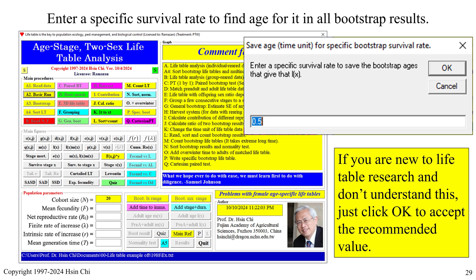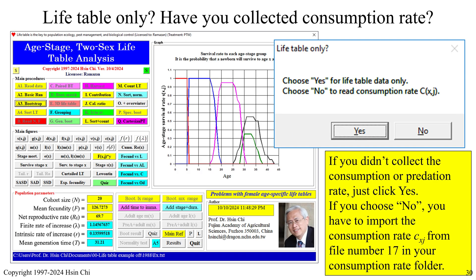When you see the survival curves, the basic analysis is completed. The 'LifeTable Only' message allows you to incorporate the consumption rate CXJ into the life table. If you didn't collect the consumption or predation rate, just click Yes. If you choose No, you have to import the consumption rate CXJ from file number 17 in your consumption rate folder.